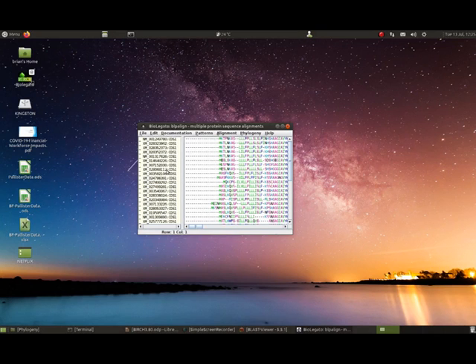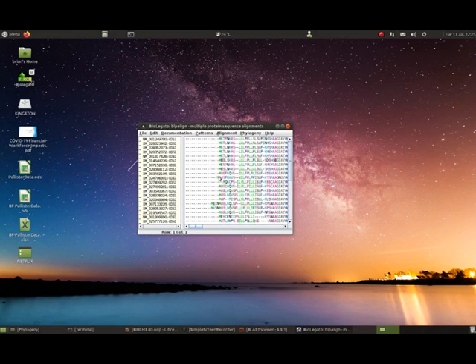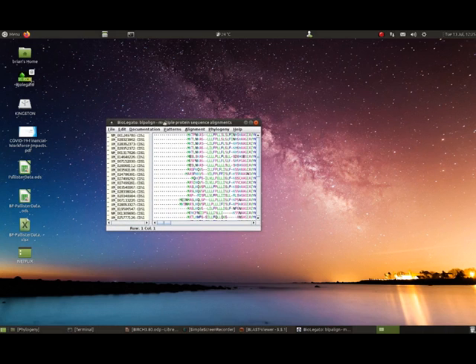Now, the most convenient type of alignment to work with is a protein alignment. We see here a set of chitinase sequences from plants. This is another plant defense protein, and they have been aligned using MAFFT, so that's really my starting point. But what I want to demonstrate is that we can also work with the corresponding DNA alignment.